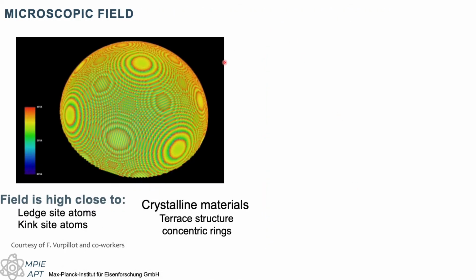And this indeed, if we move back to the previous lecture on the field evaporation principles, the specimen will be faceted and will present the intersection of a spherical surface, a spherical cap, with the crystalline lattice forming this series of terraces with a different size and corresponding to different interspacings, basically. So different facets corresponding to different sets of atomic planes.